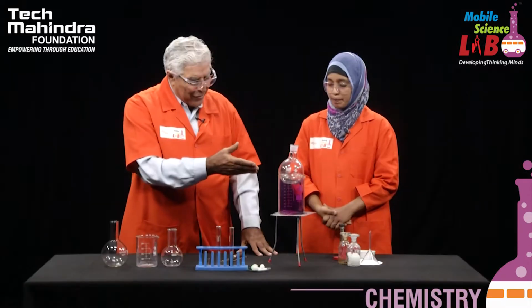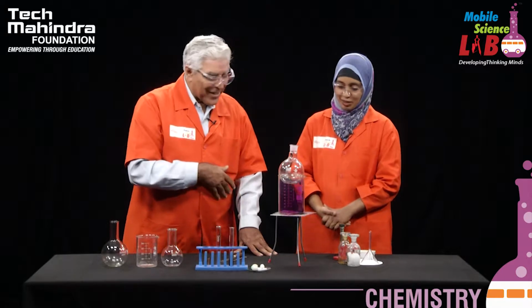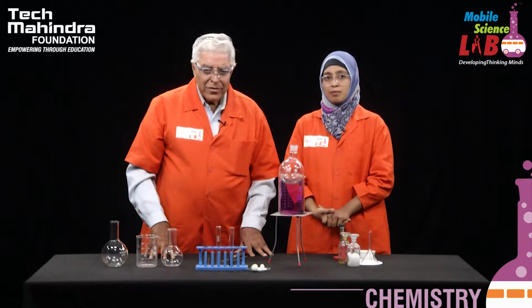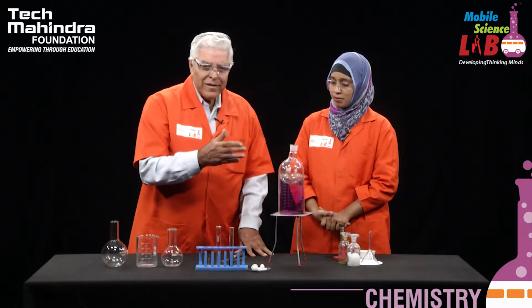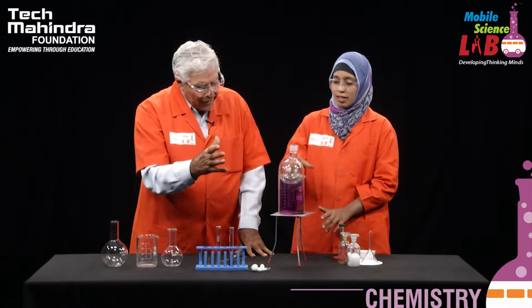Now this looks so nice. It looks as if there are some stars shining in the night sky. Yes, sir. Very beautiful. So this, my dear students, is called sublimation. We have heated iodine, it converted into vapor, solid became vapor, and when it is cooling, shall I take it out, sir?